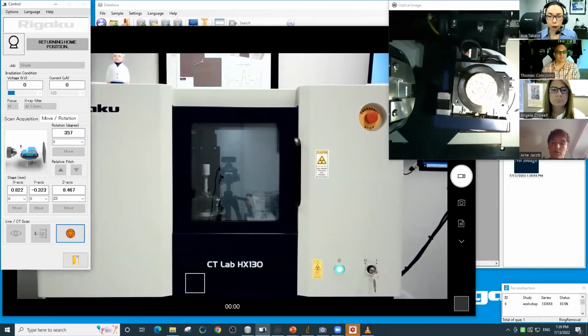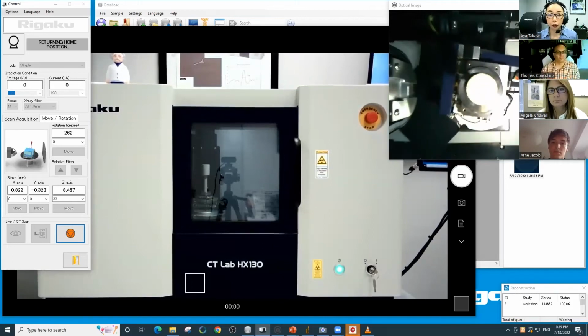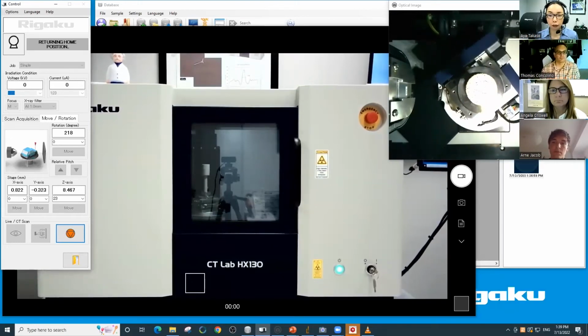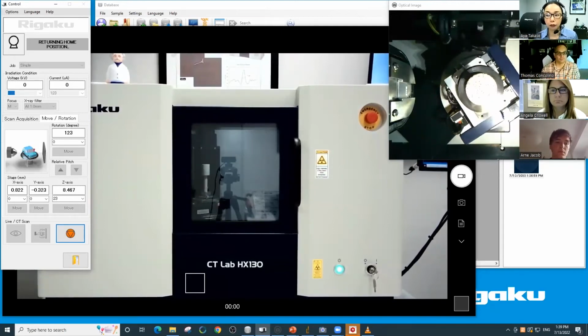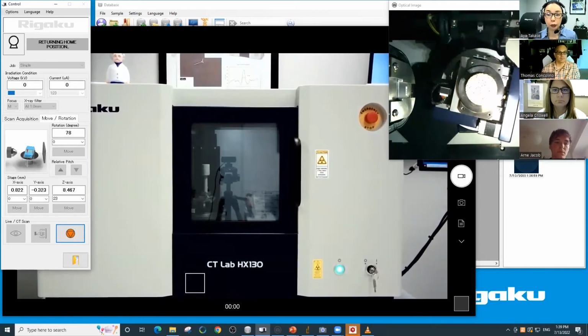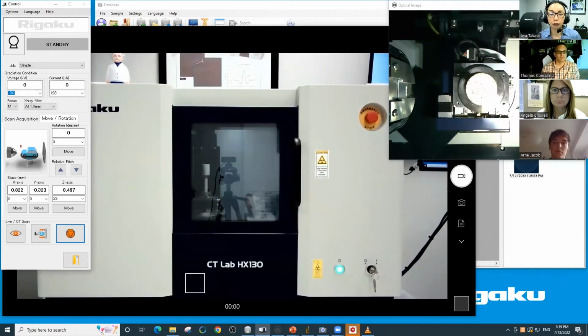The other thing to consider is if your computer is powerful enough to do a calculation real fast for that FOV, you can make it bigger. Usually the FOV that's good for the simulation speed is smaller than what your CT scanner can cover. So depending on the computer speed, you don't need to choose exactly 5 times the grain size. It can always be bigger. As far as the calculation time works, you might want to make it a little bit larger.